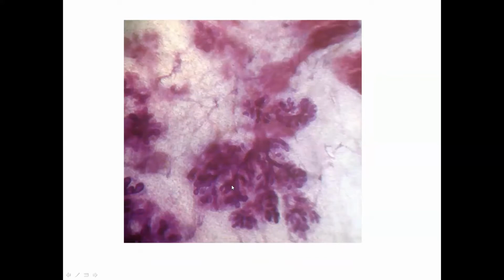Then this is the picture that I did using a stereo microscope. There is a very simple technique that you can do. It's a very simple and cheap technique in which you can make the breast tissue transparent.